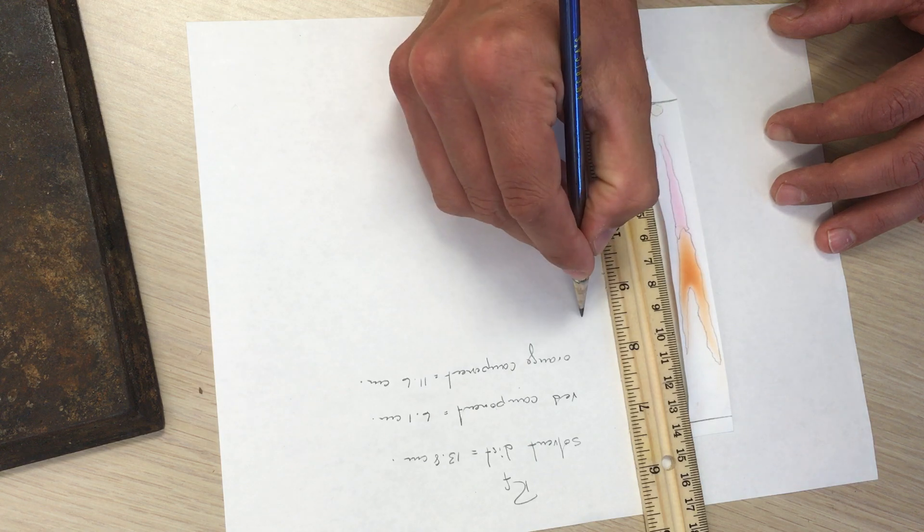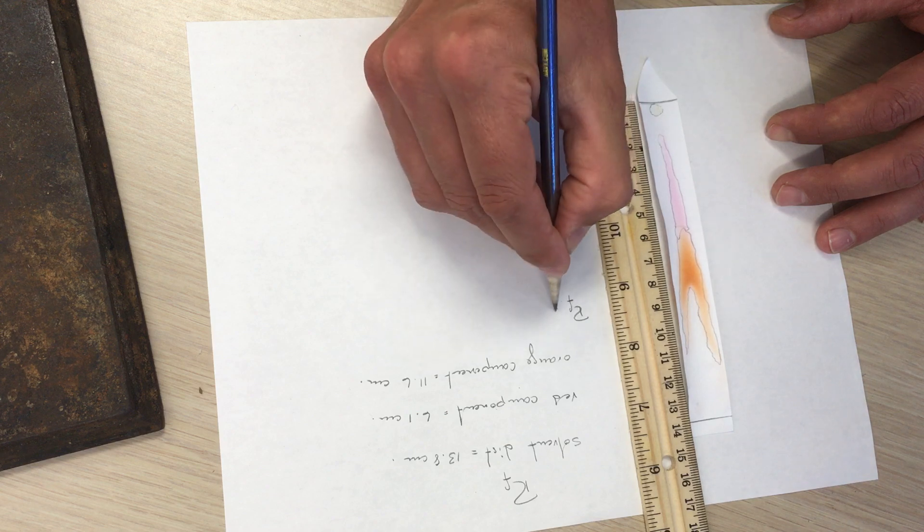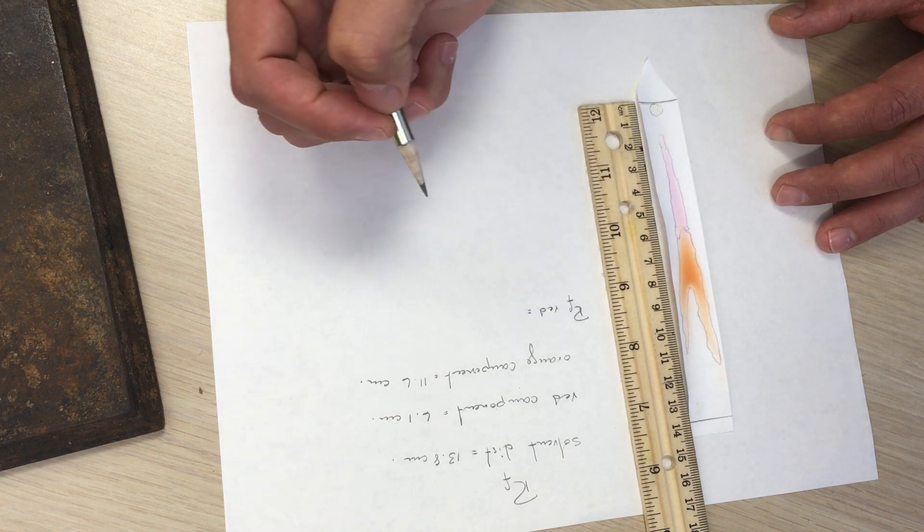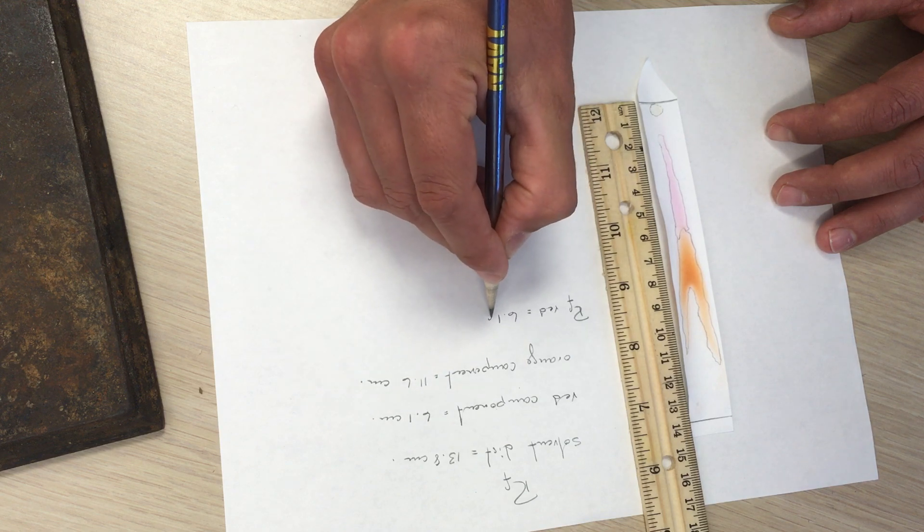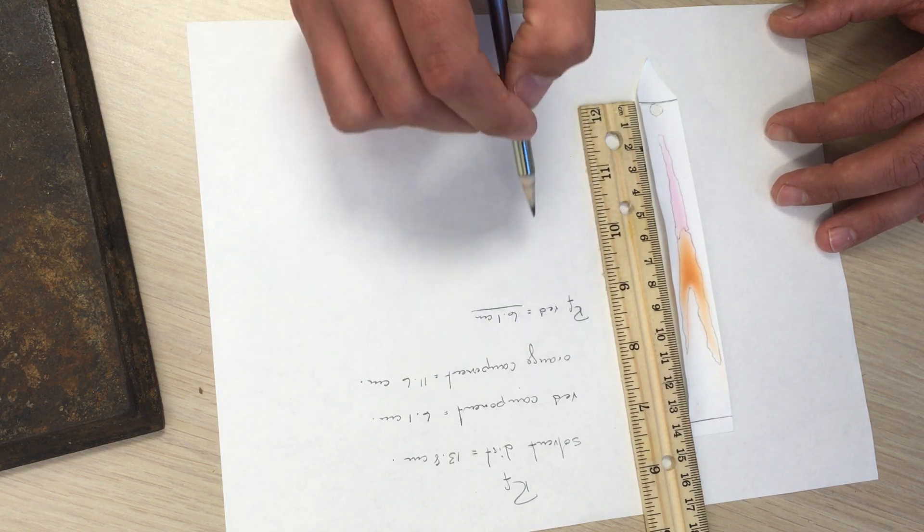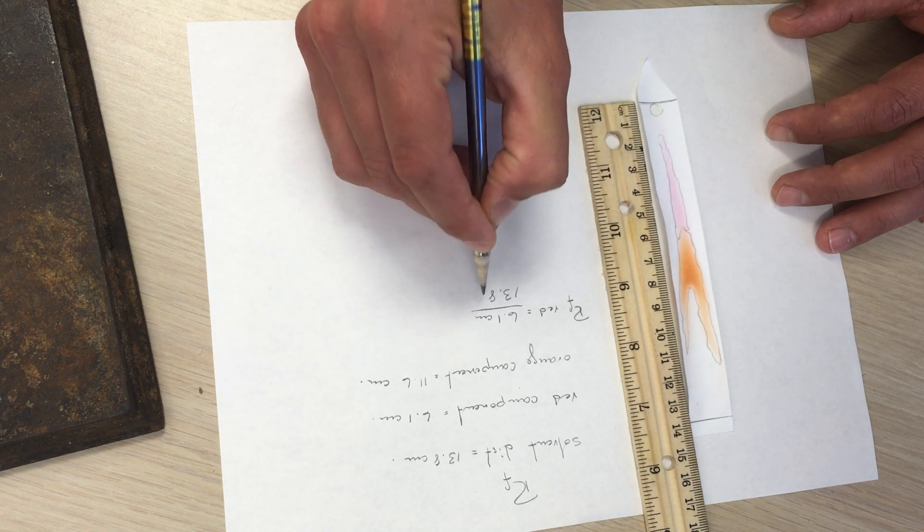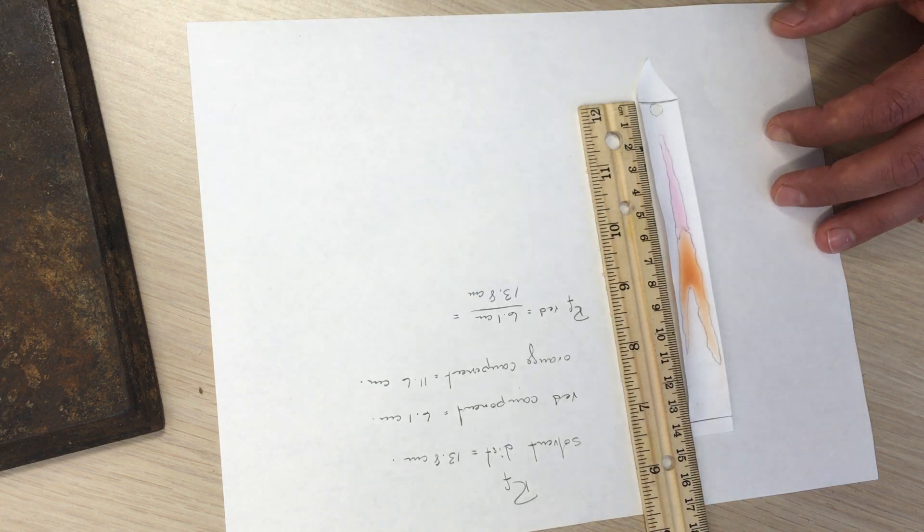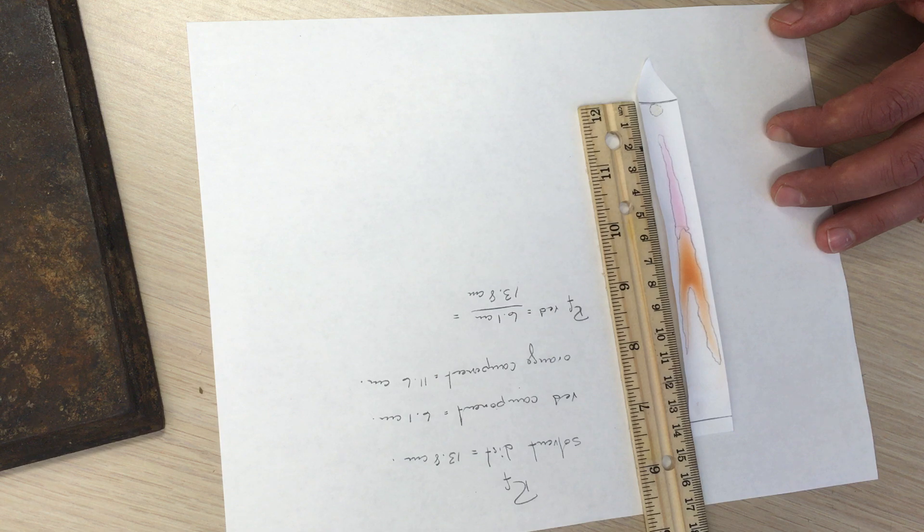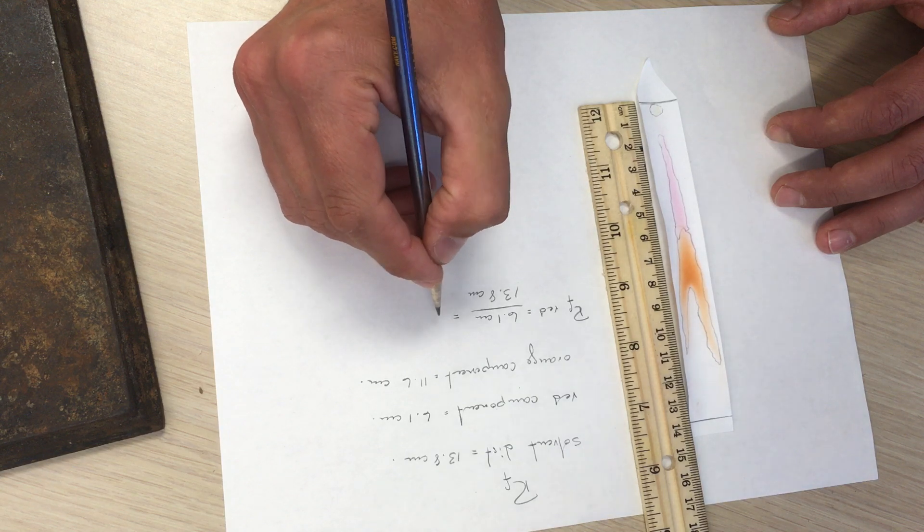So then we can calculate the ratio of front for the red color, which is the distance that the red component traveled, 6.1 centimeters, divided by the distance that the solvent traveled, which is 13.8 centimeters. And so when we do this we get an RF of 0.44.